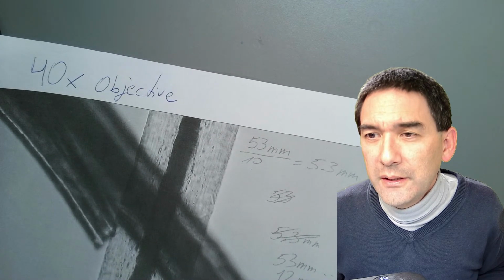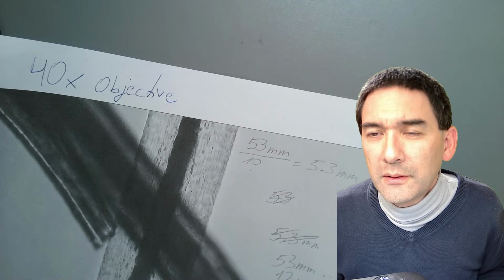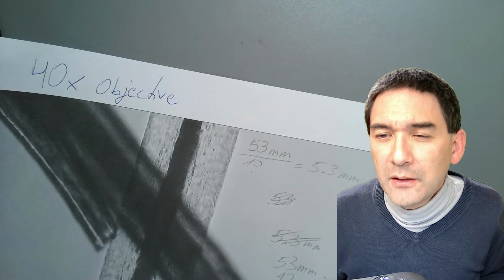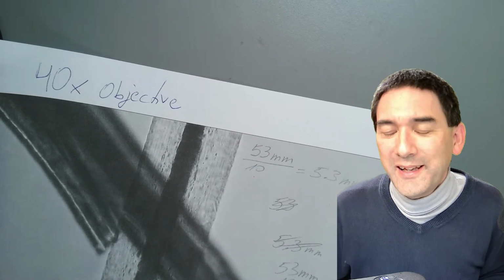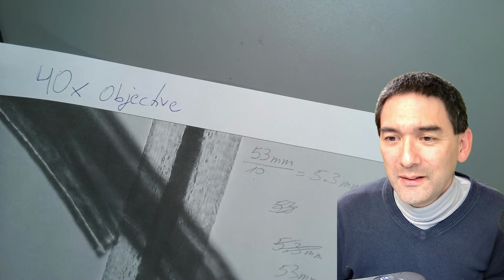So there is, I hope I'm not overlooking anything. On your picture of the scale of the ruler, we can see an interesting regular pattern of the ink. Yes, exactly. Okay.